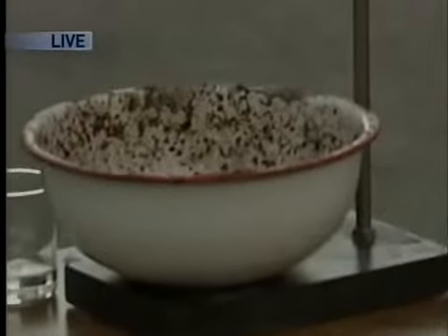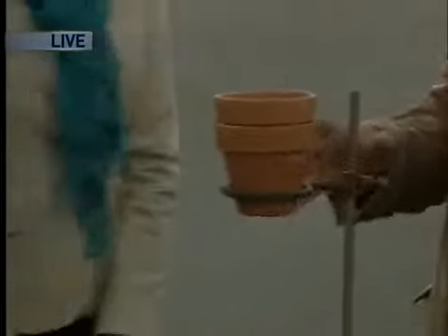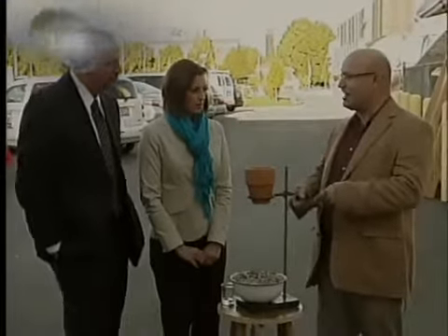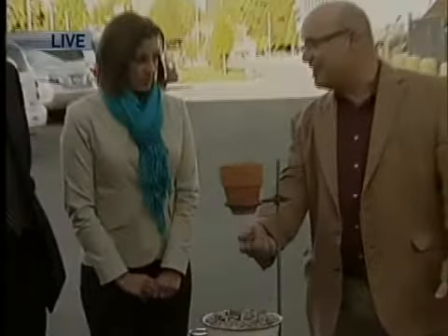And we're going to take that and mix it with some aluminum powder. This is actually aluminum flake because it was easier to see than the powder. So with the aluminum and the rust, the electrons are going to flow from one to the other, and the aluminum is going to become aluminum oxide. And the ferric oxide, or rust, is going to become molten iron. It's going to give off a lot of energy, and it's a lot of flame and destruction, and then you should see some molten iron dripping out of the bottom of this.